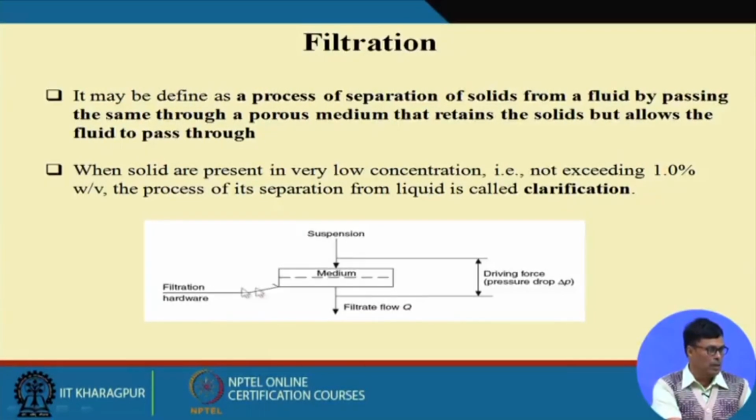In filtration, basically this is the media, this is the filtration hardware, and these are the suspended particles. They come in, and this is the driving force, the pressure across the membrane, and we get the filtrate out. It may be defined as the process of separation of solid from a fluid by passing it through a porous media that retains the solid but allows the fluid to pass through.